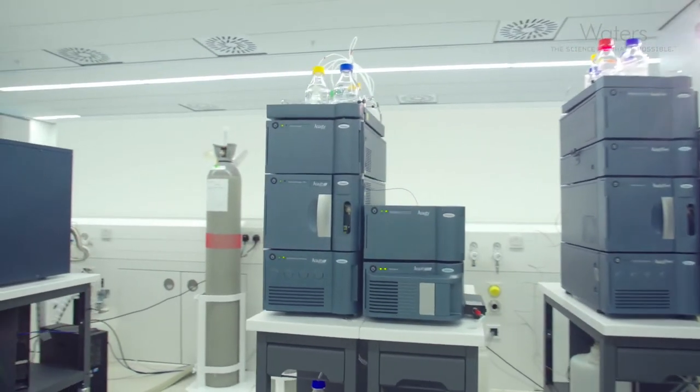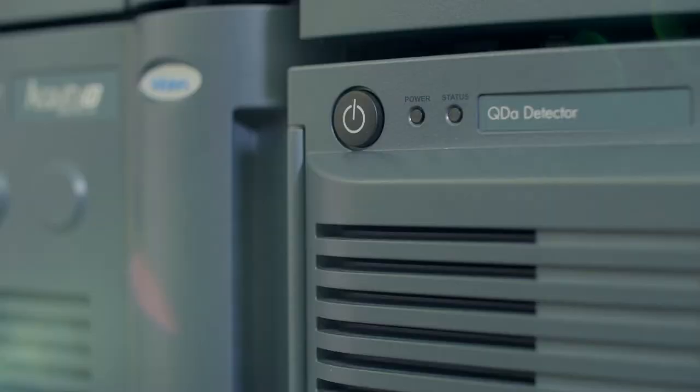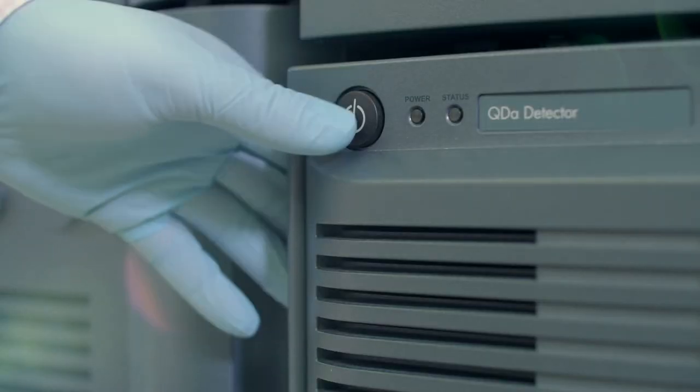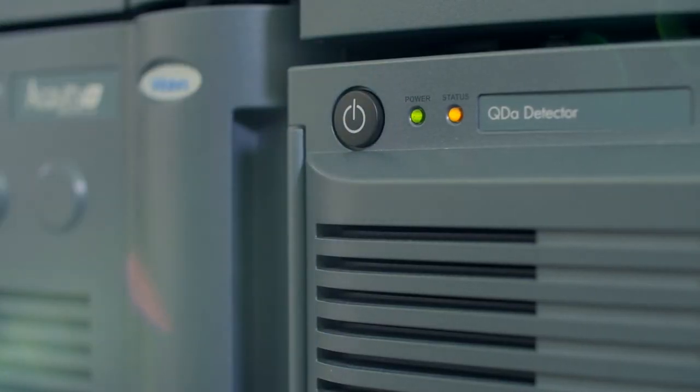Startup couldn't be easier. We walk up to the system, we press the on button, and then we go for coffee. When we return, the Acuity QDA is ready to go. We're ready to acquire data.